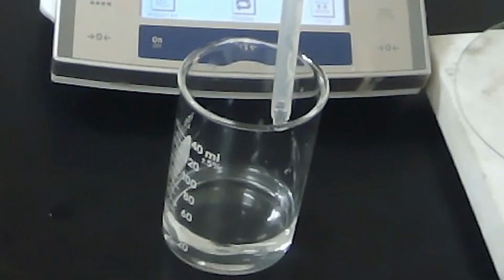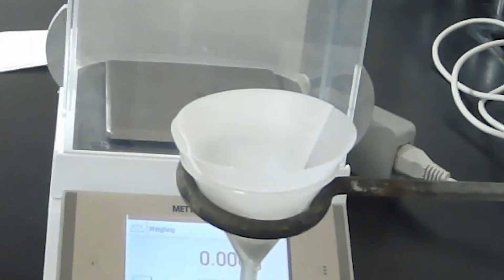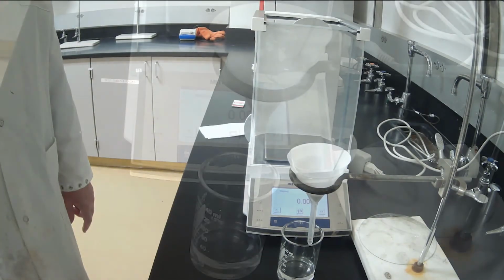If you guessed water, you're correct. So we have to remove all the water that's here, and we have to remove all the water that's soaked into our paper before we can do any more weighing.